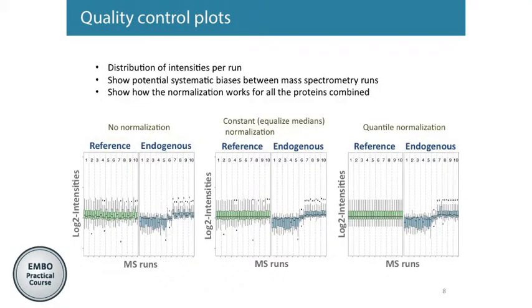So if you click it, three visualizations will be generated. The first one is what we call the quality control plot, the second one is a profile plot, and the third one is the condition plot. Each one has a different aspect we can check. The first one I will go over is the quality control plot. This is a box plot. It is a summary of all the measurements for the experiment.